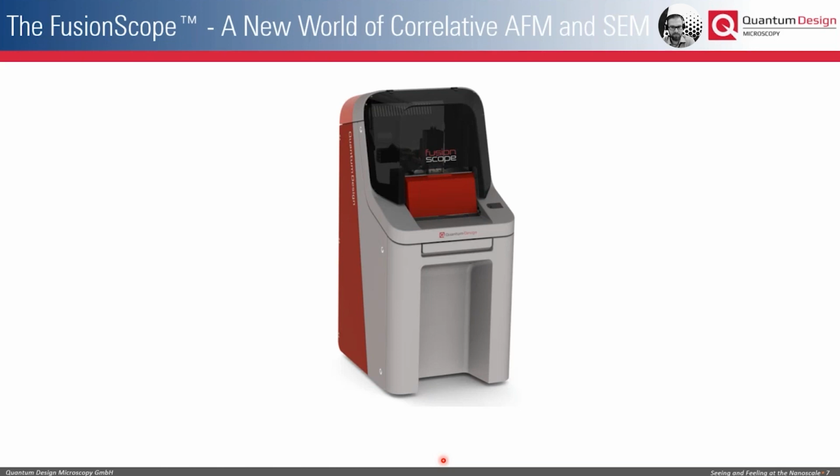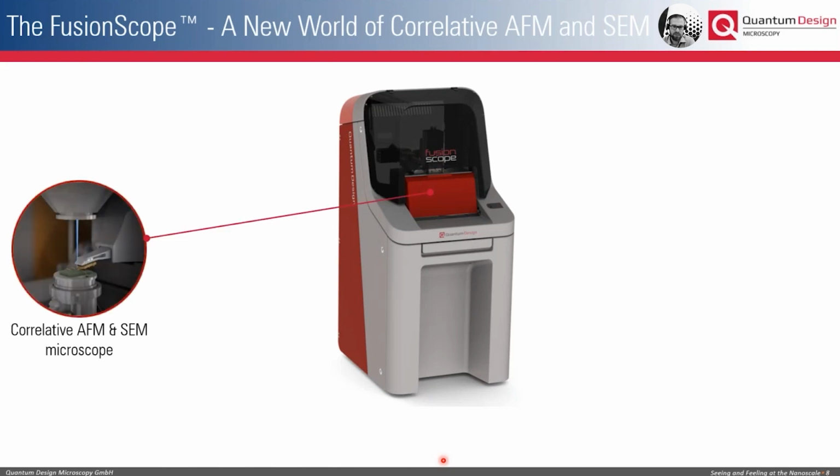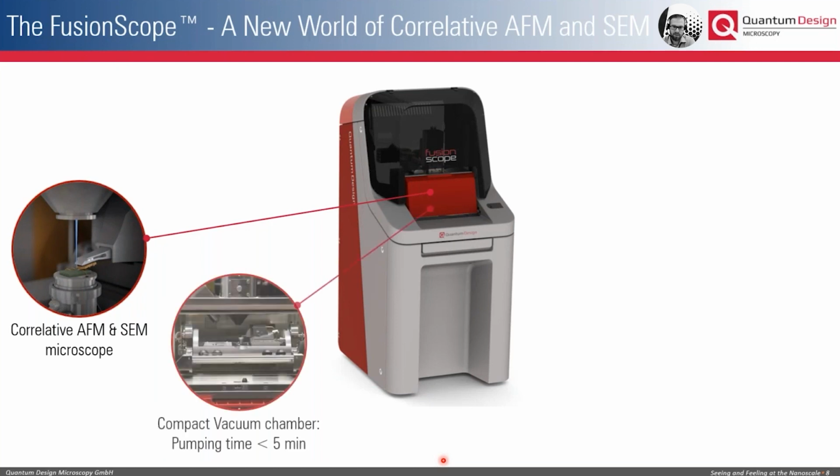And just to tell you some basic features about the FusionScope. To our knowledge, this is really the first true correlative AFM and SEM microscope that seamlessly integrates both of these microscopy techniques in one software interface and in one host system. It has a very compact vacuum chamber, which allows you to switch samples quite easily and fast and enables you to have pumping times of less than 5 minutes. So you can really easily and fast start your correlative measurements once you swap the sample.